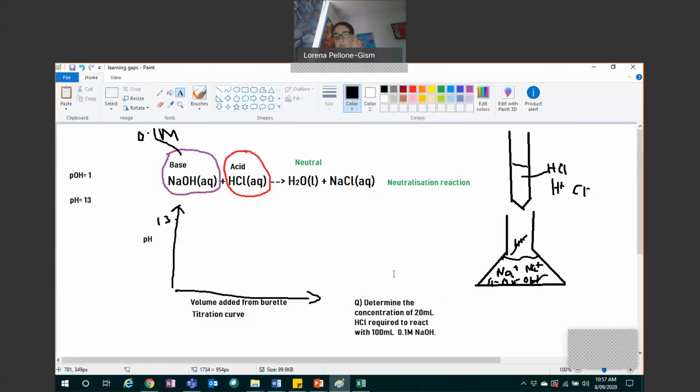So the first thing you're doing is you're adding the HCl to try and neutralize the sodium hydroxide. And what happens is you add it and it pretty much turns into water when it comes in. So it's still basic, still quite basic. It's like you're diluting the base one drop of water at a time. Every time you add a drop of HCl, it turns straight into water because it reacts with the hydroxide.